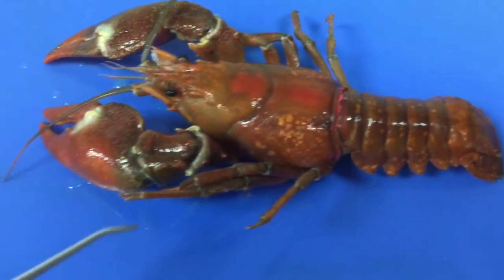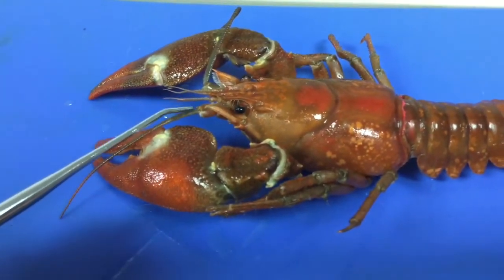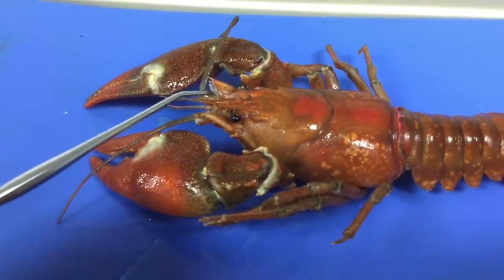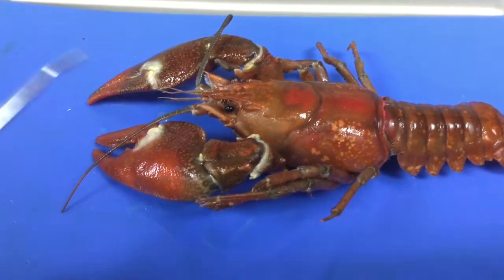I know you just want to get in there and mess with it. The antennae, these are antennules, the little ones, and then the long one would be the antenna. And of course we have two pairs, antennules and then antenna.